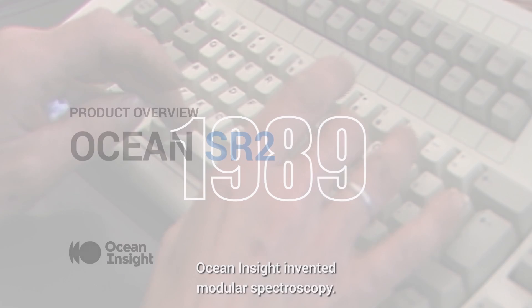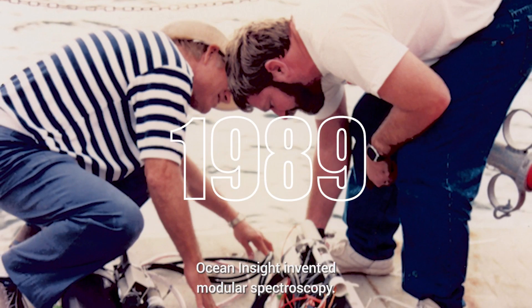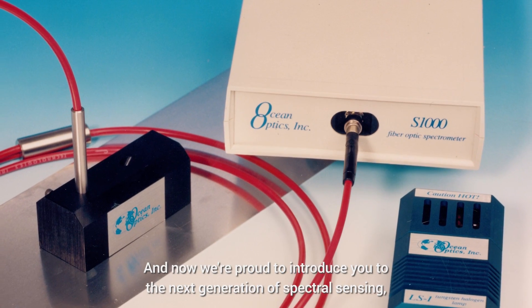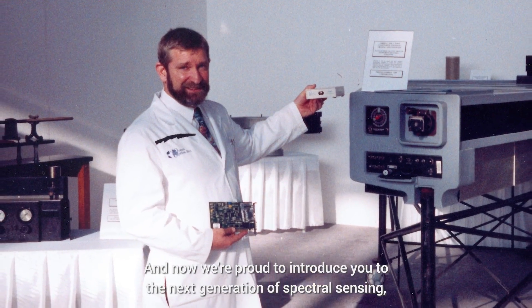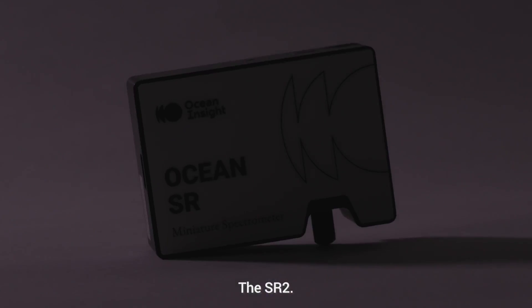In 1989, Ocean Insight invented modular spectroscopy. And now we're proud to introduce you to the next generation of spectral sensing, the SR2.